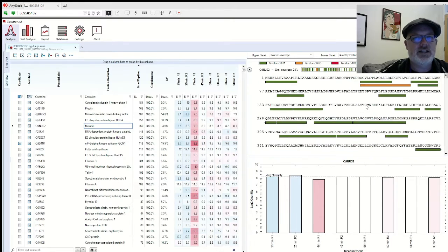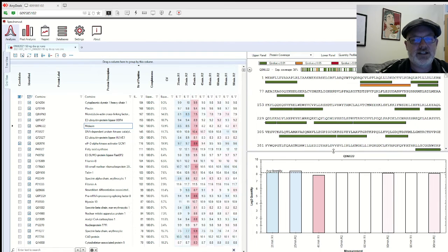So what we can do on the bottom is the profile. Thankfully, we can change this now, since it defaults to log 2. Remember, if it's a log 2 change, it may look the same when there are actually major differences, right?